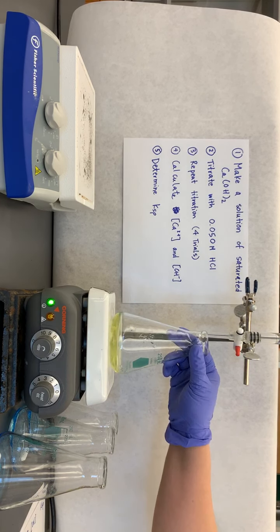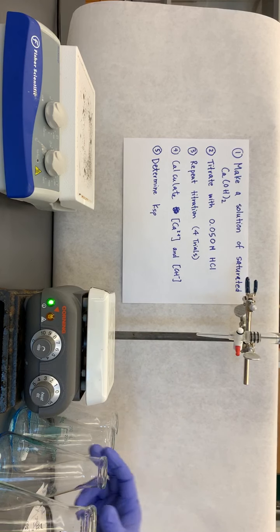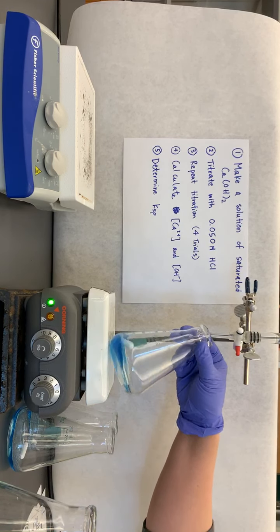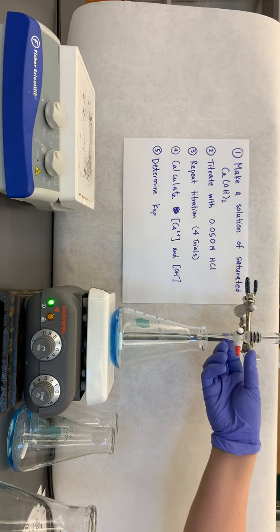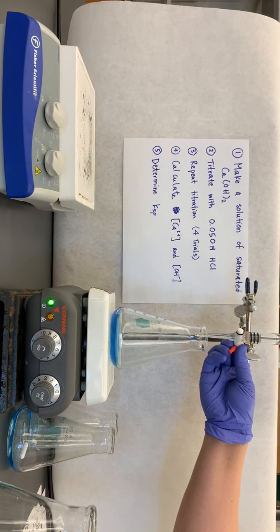Okay, we're going to take this off the plate, and we're going to do our next titration here. And again, I have my blue, and I'm going to continue to add my HCl.